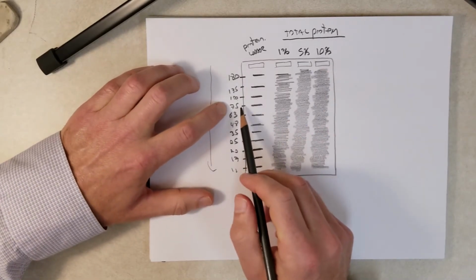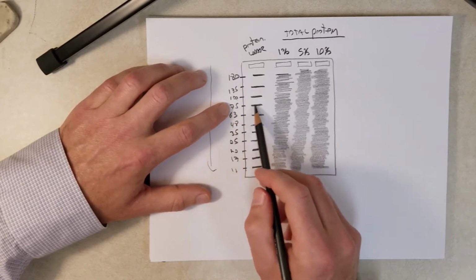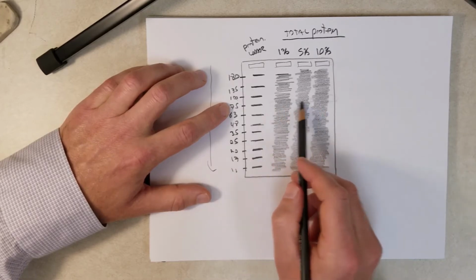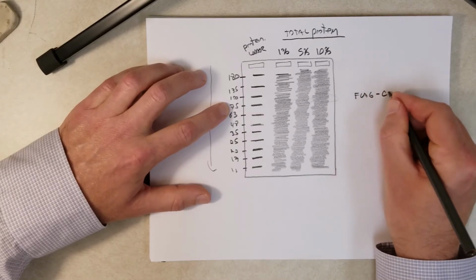So, we could do a simple calculation on the sequence of the flag CDC45 and determine that it should be about 75 kilodaltons. So somewhere in here should be where the CDC45 flag fusion protein is located.